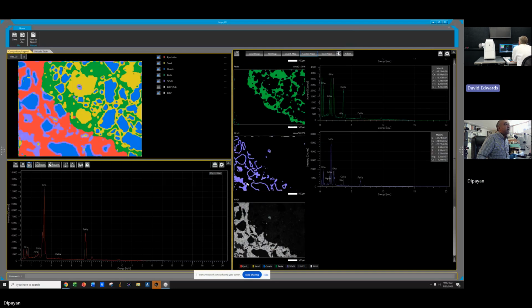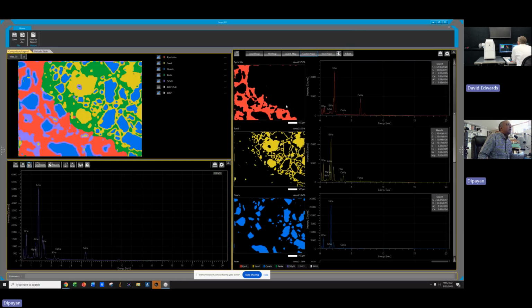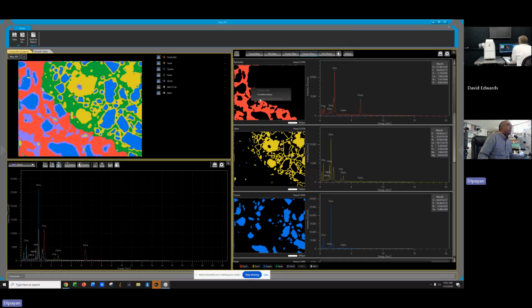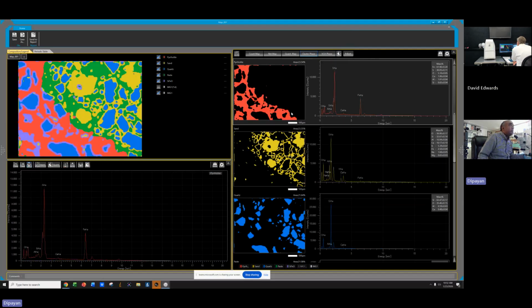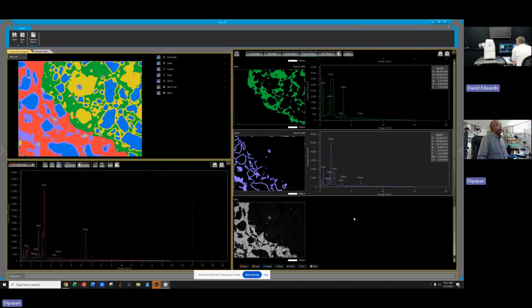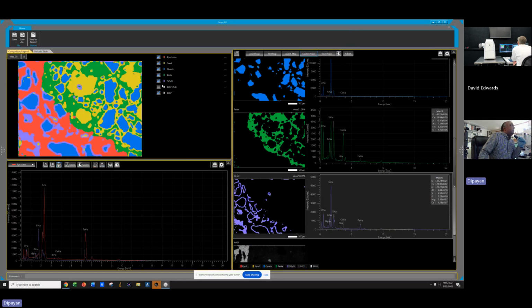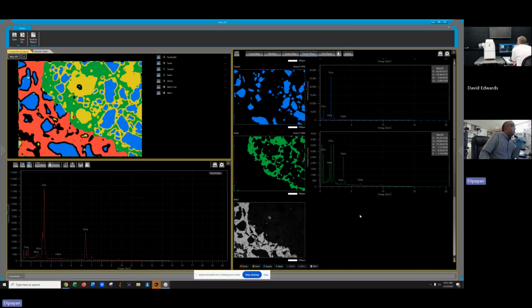So you do know that you can combine the boundary with something else, right? So all I do is click that one, then press the shift button, go to the other one and press combine. Not shift. Use the control button. Don't use the shift button. Oh, I was doing the shift button before. No, control. There you go. Now right click. Okay, I see. But in this case, I can just remove that margin. There is no new phase there.